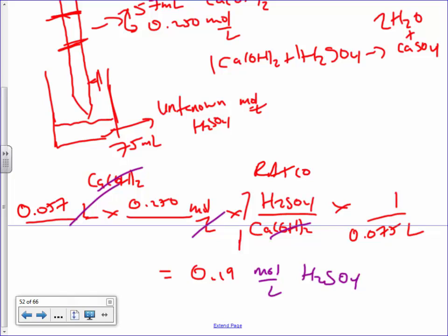First, you have to make yourself a primary standard solution using some sort of weight on a scale, make a solution, and then use that as your known concentration, titrate it until the endpoint turns pink. At that point, that's when you know when to stop. And then you can do a math calculation, and that will find you a concentration. So quantitative analysis for concentration actually kind of sucks. Does that make sense?